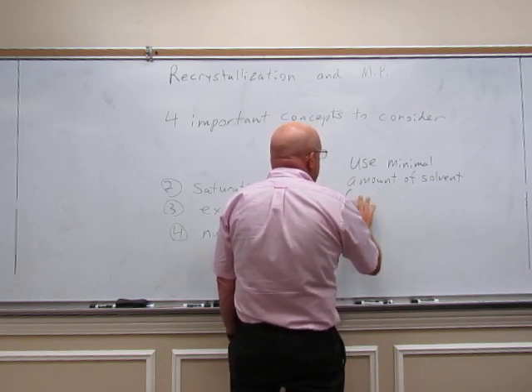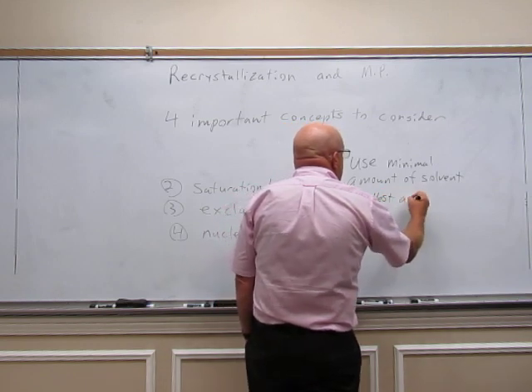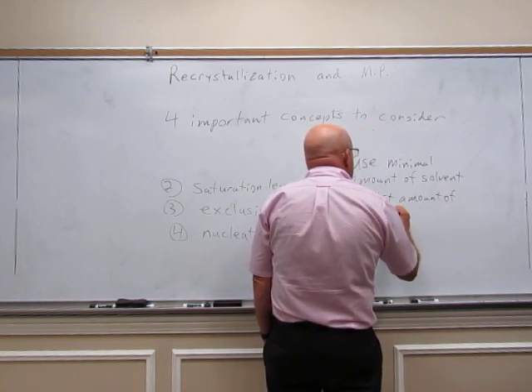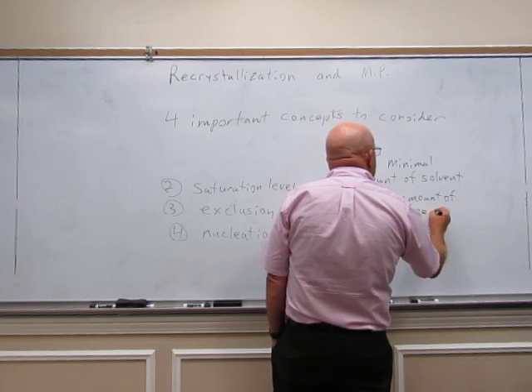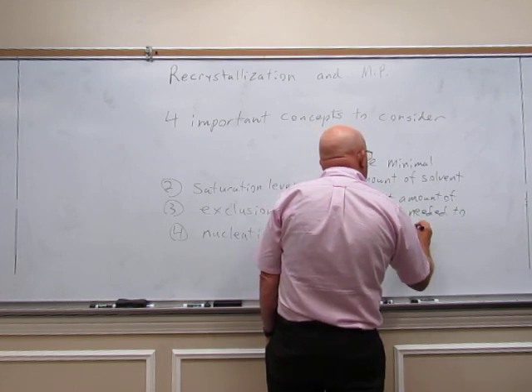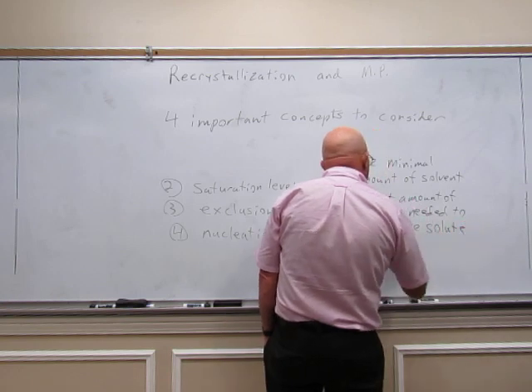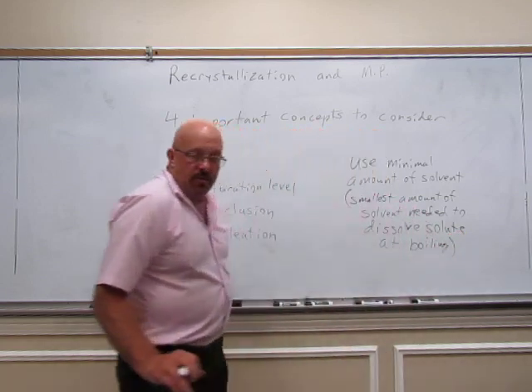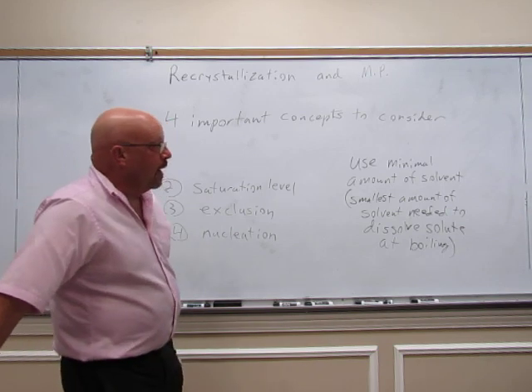So the smallest amount that you can get away with to dissolve the solute at boiling.